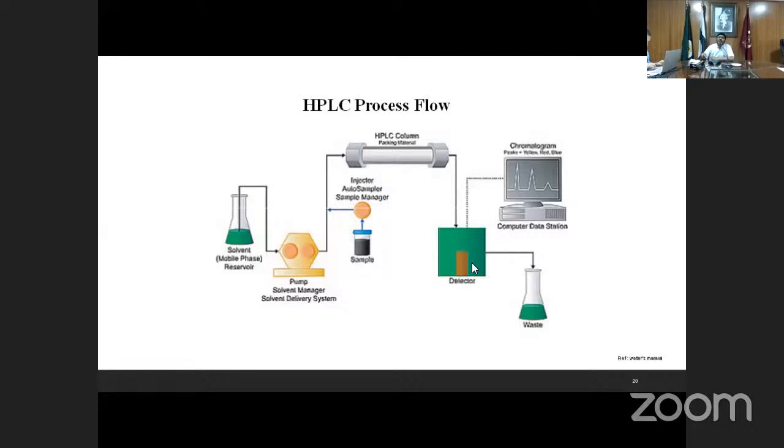Not always are UV detector or PDA detector used for one kind of analysis. It's a different kind of analysis, different disciplines; people are listening. So different applications can demonstrate different detectors here. Then this is the computer data system, which records the detector response. This is the electronic response of the peak, and in HPLC normally these kinds of peaks appear, and this peak will show us its peak height, area, and everything. We'll explain this later on.